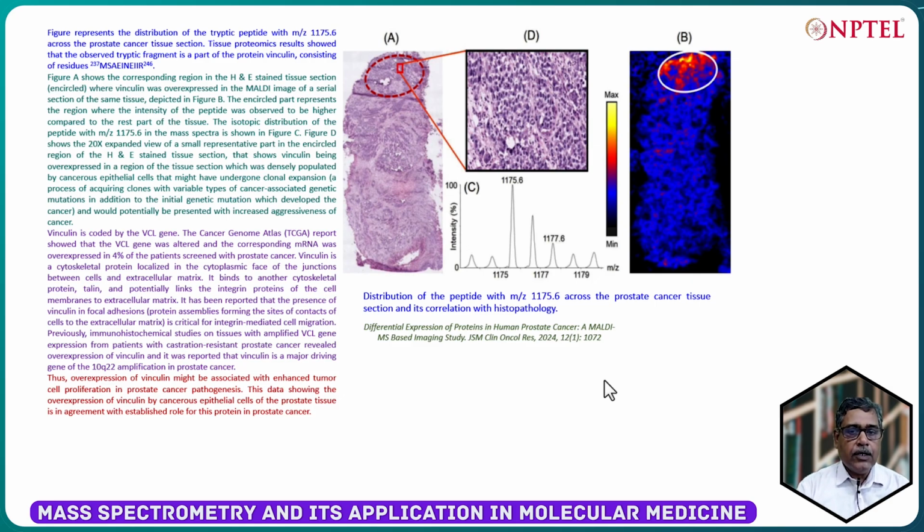Now, I will talk about those three proteins that we were left with out of the comparison between the imaging that we got for different peptides and the analysis and characterization of different proteins that we got in a simultaneous proteomics approach. So, we talked about 52 proteins that were seen.